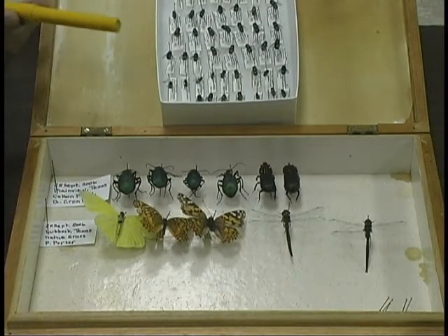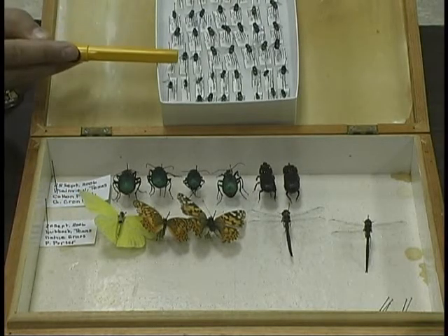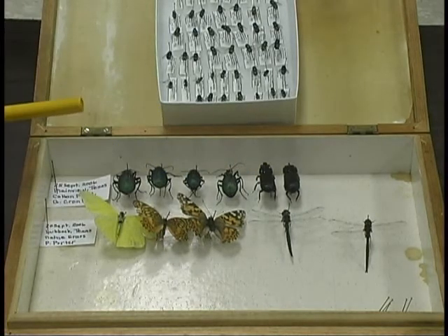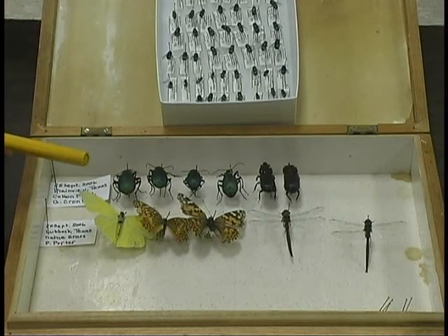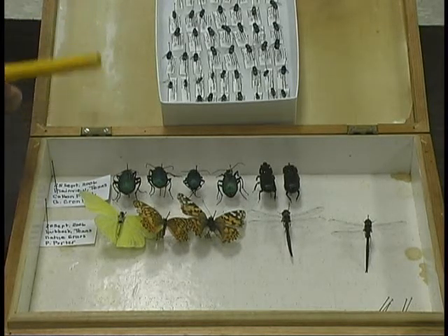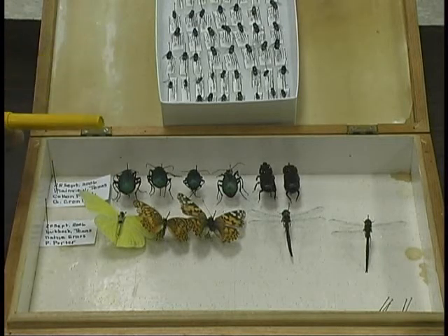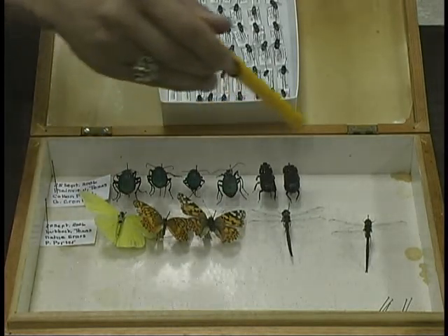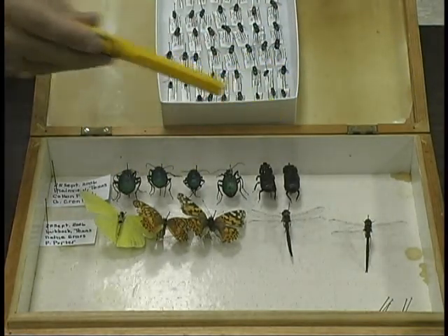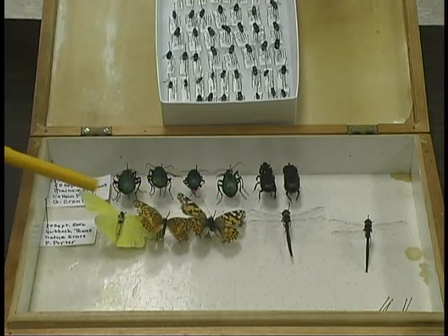Here are two examples of how to preserve your insects: a temporary collection procedure and a permanent collection procedure. With the temporary procedure, once you've collected and pinned your insects, you retain them somewhere until you can get the appropriate label information on the insect. For example, if you go out and make a collection, it's appropriate to come in and label a single label and place your pinned insects along one or two rows. The lepidopterans — these butterflies — have been angled in so that you can squeeze more insects into the drawer.